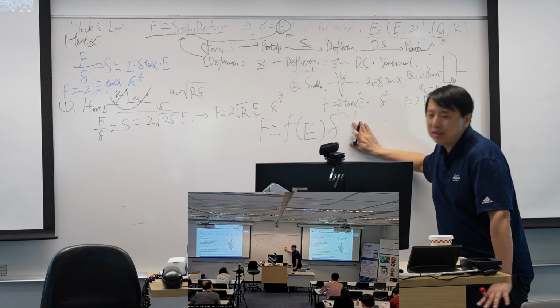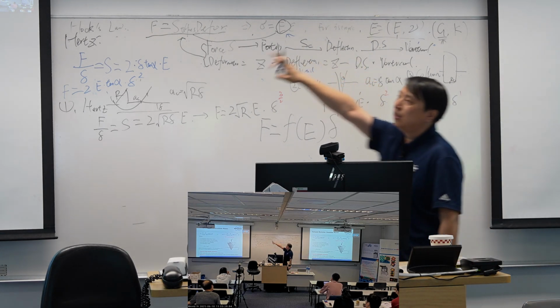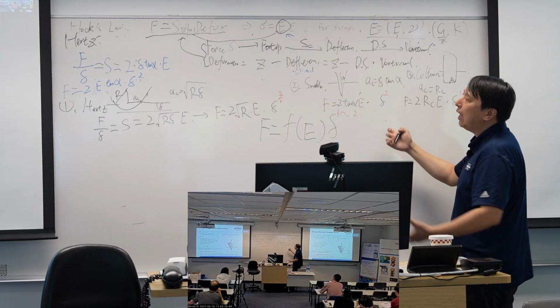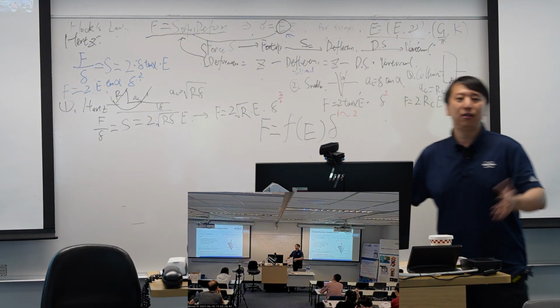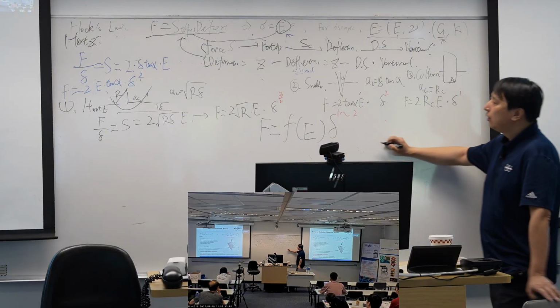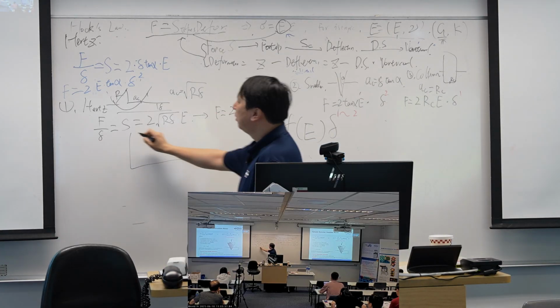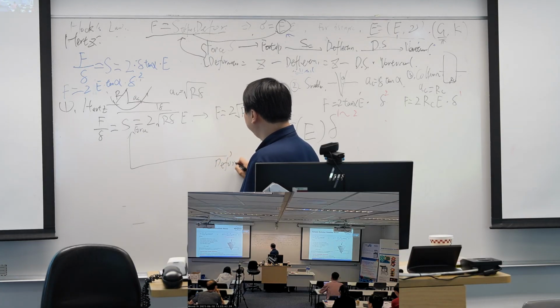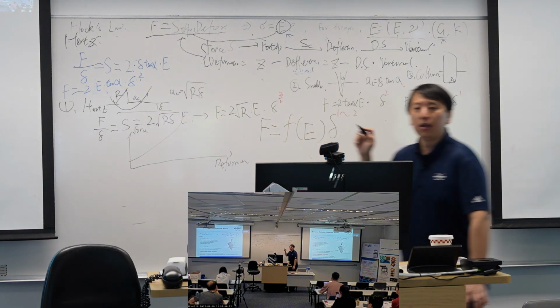And after that, people do not use the classic Hertz model. So they don't need to really calculate the a_c, what it looks like. They don't care about that. It's just a function of the deformation. So finally, they will do something like this. They capture a force against deformation curve, and the curve is something like this.